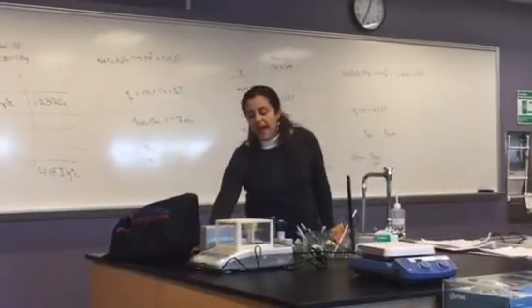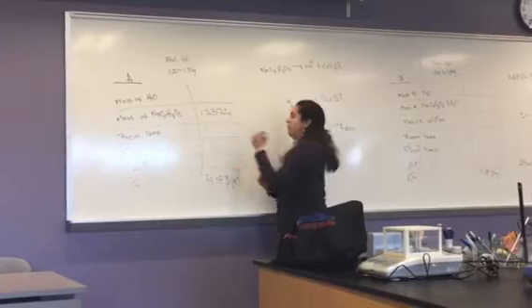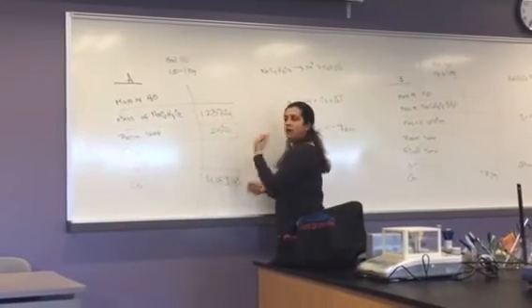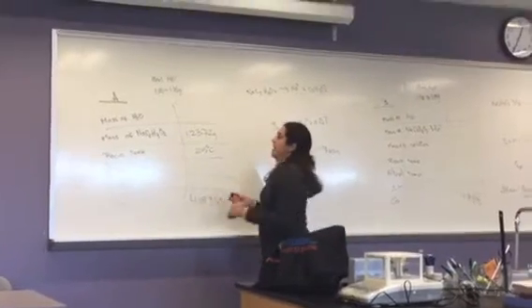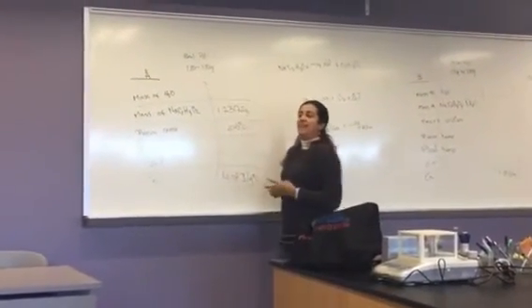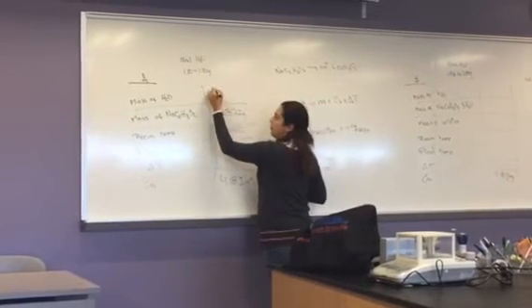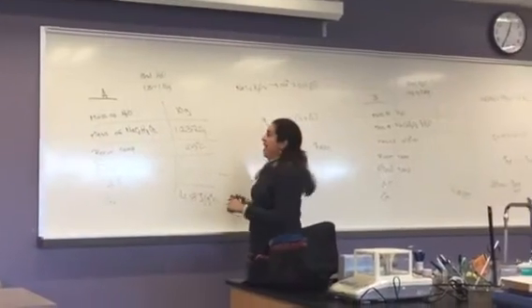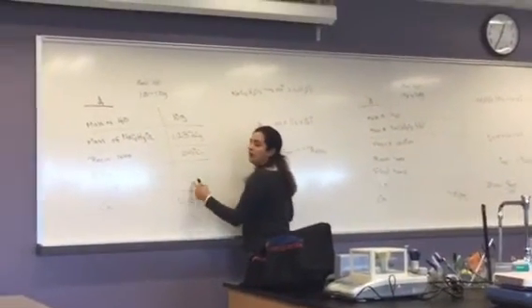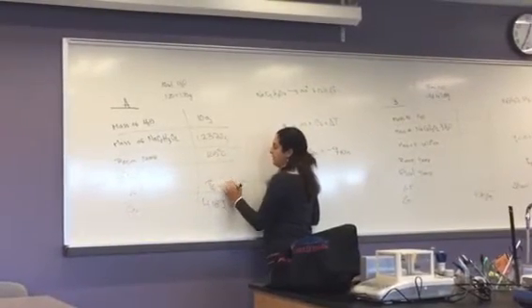Once we have done that, you record your room temperature, maybe 25 degrees. Your final temperature might go up, it might go down. The mass of water, because the density of water is 1 gram per milliliter, is going to be 10 grams, correct? So what you're going to do is calculate the delta T, which is going to be the final minus the initial.